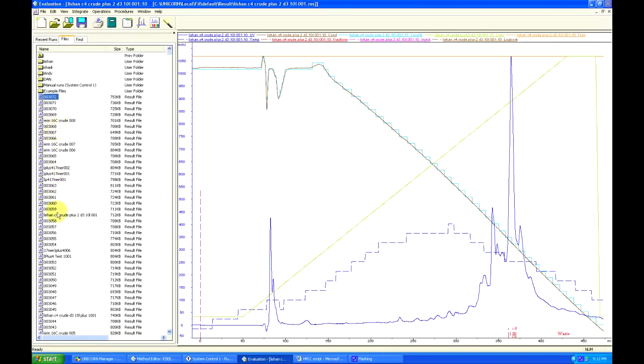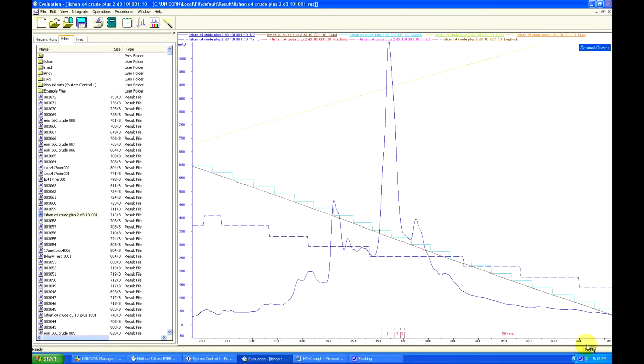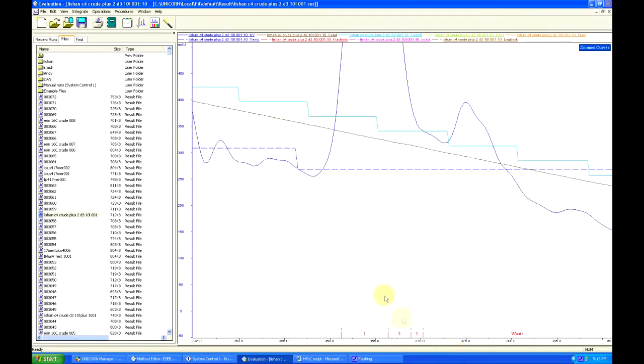In the evaluation window on the left side, we can see a list of all the previous runs listed by name. We can double-click a name to open that run. We can then analyze the chromatogram and the quality of our fractions using a left-click drag function to zoom into specific areas of the chromatogram. Zooming in further, we can see exactly where our fraction collector started and switched collection in a specific test tube.